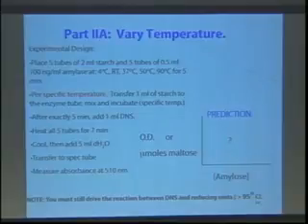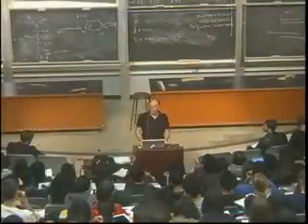Ideally, we would do blanks at every temperature, meaning you would have that starch at 4 degrees, 37, and do the blank. But these students already complain because it takes a lot longer than the other students, okay? So to do it right would be additional blanks, but it would add another half hour, so we don't do it the ideal way, okay? Is that clear? All right.